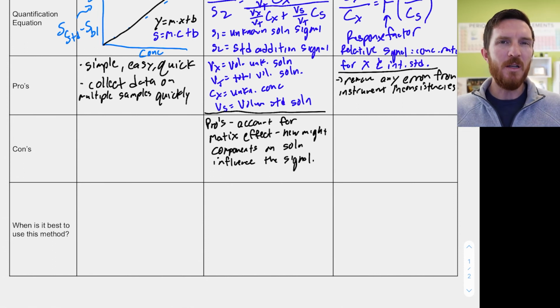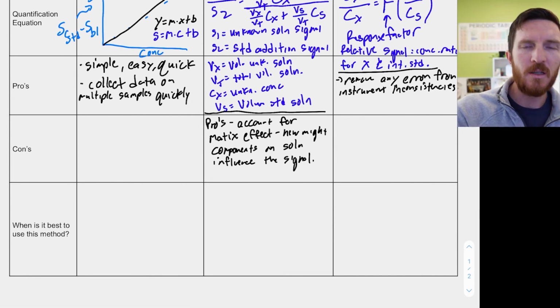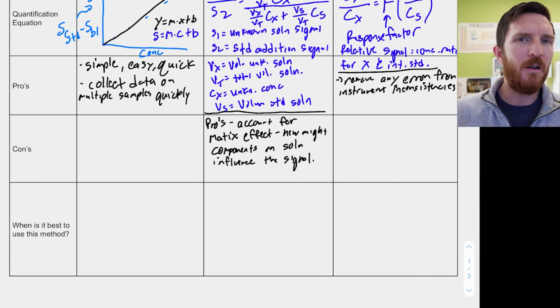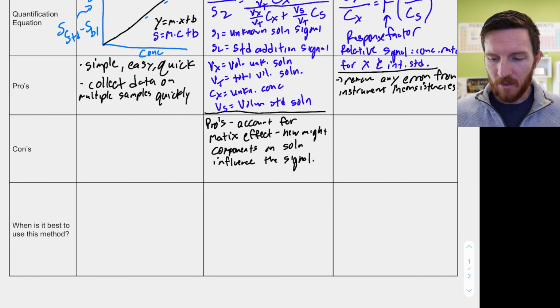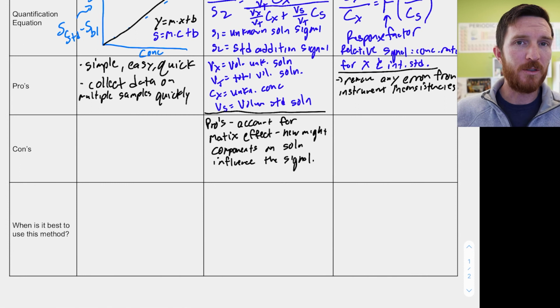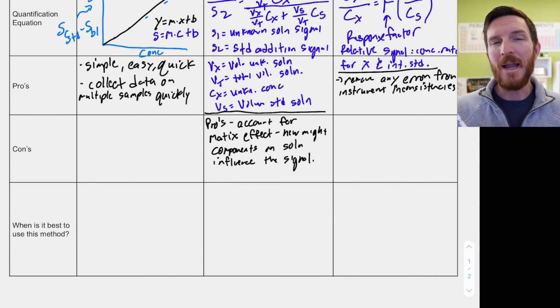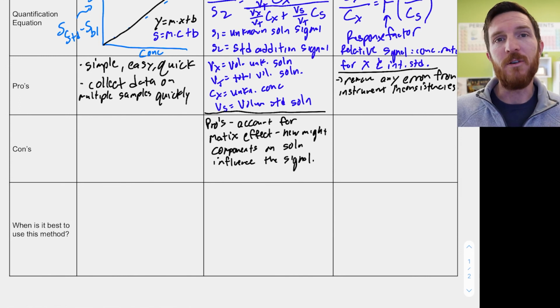So if I have an instrument that is not really good at being precise from one run to the next, to the next, to the next, perhaps there's some slight deviation. If we're thinking about maybe gas chromatography, maybe our pressure or flow is not kept perfect, and we get these issues in area that are influenced not just by the concentration, and this is going to account for that. And I'm going to be able to compare if I have an enhanced area for my internal standard, the standard that I add in, relative to my original sample, all we can see is going to account for that. And so we see these two extra ones, the standard addition and internal standards, are accounting for specific errors or issues that can happen when we're looking at different types of standardization.